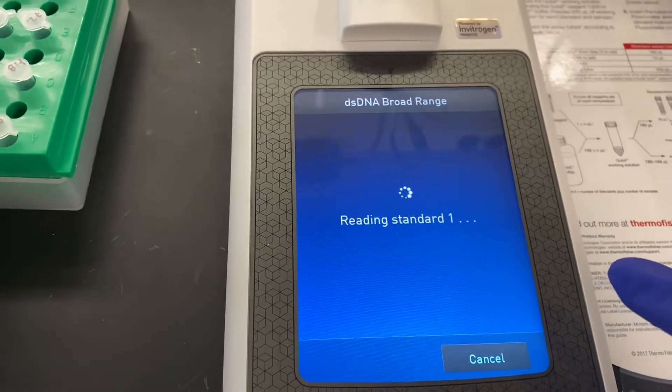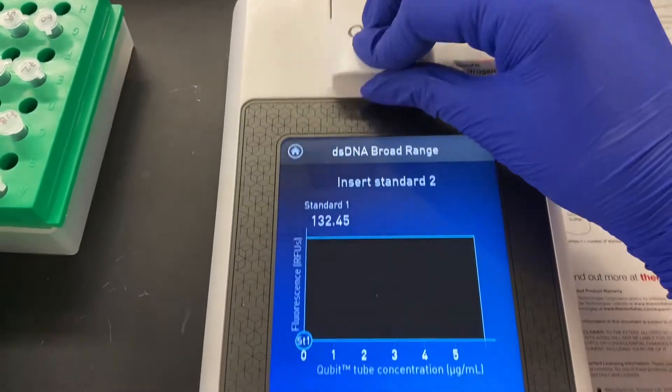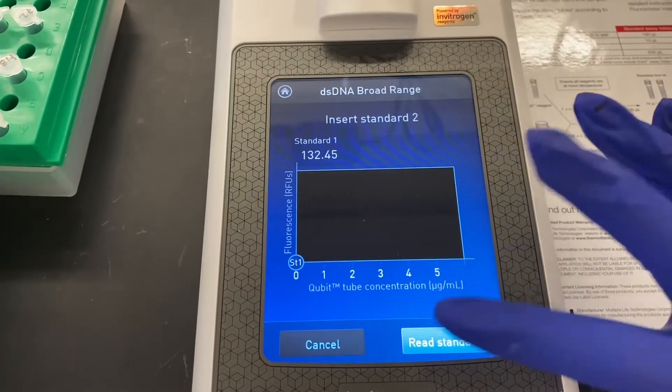If the instrument reads in both standards and doesn't give an error, then you're good to start prepping your samples for the rest of the assay.